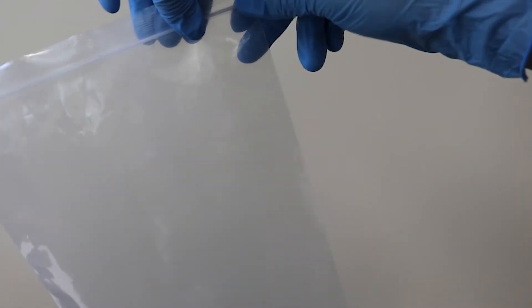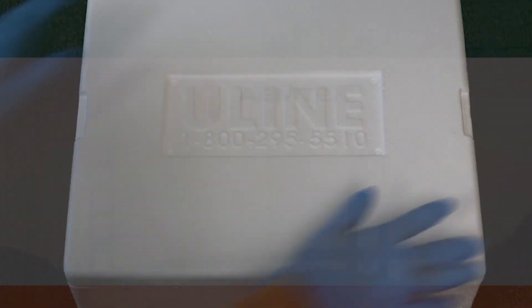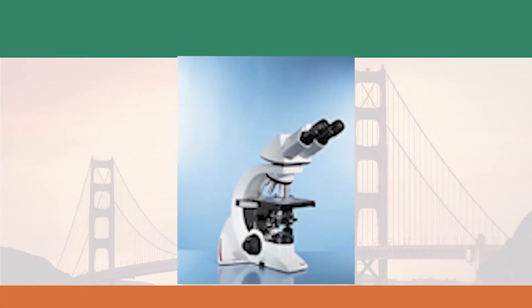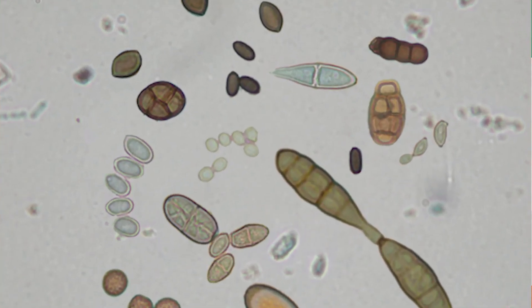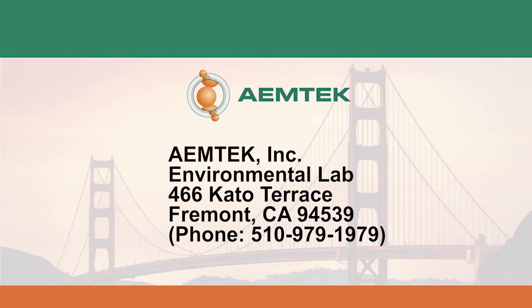Pack the cassettes into plastic Ziploc bags and place the bags as well as the COC form inside a secured box for shipping. Ship the samples to EmTech for spore trap analysis that includes mold spore count and identification. Expedited service is available. Our address is EmTech Inc., Environmental Lab, 466 Cato Terrace, Fremont, CA 94539.